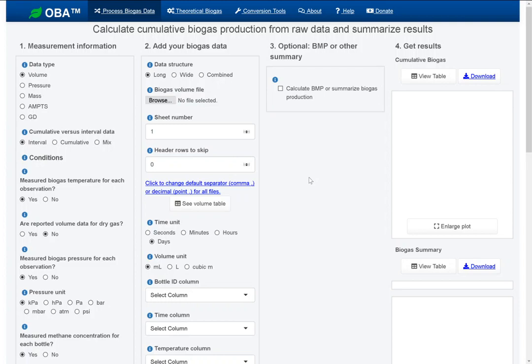Sasha Hafner here, and this video is just a really brief intro to OBA, which is a web app for biogas research in the biogas industry. For details on any of the tasks that I'll mention in this video, to figure out exactly how to do them, take a look at the other videos in this playlist.